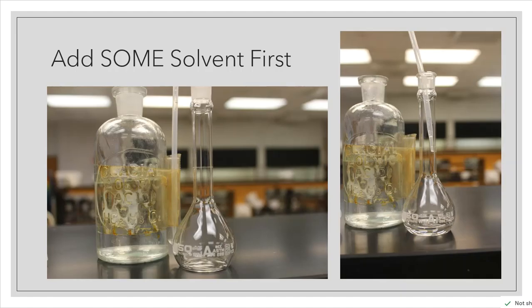All right, so I'm going to take the volumetric flask, and I always start off with a little bit of solvent first. So this is my glacial acetic. This label, by the way, is called stock because there's no label on it. It just came from a jar that we've poured in there from another bottle somewhere in the lab. So I'm going to take this plastic dropper. I'm just going to suck up some glacial acetic and add it into this volumetric flask, a couple of squirts at least. You can see the amount of acetic that's down here on the bottom now, just to have a little pool for bromine to swim around in when I do get to that point and add it into this solution. So a little bit of solvent goes a long way, especially in solution prep. So solvent added first, not up to the top, of course. Then we're going to add our bromine, and then we'll top it off where it needs to go in just a second.